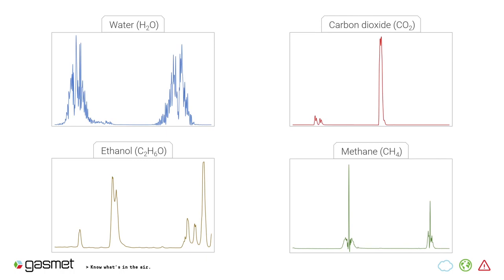So now that we have taken the measurement, what do we do with it? We talked earlier about how absorbed infrared light depends on the bonds and atoms. In different molecules, these are different, so different molecules will absorb light differently. This also means that the infrared spectra for different molecules are different, so they are like chemical fingerprints. So by comparing infrared spectra of known compounds to our sample, we can determine which compound it is. Here we have examples of 4 different compounds, and you can see that their IR spectra are quite different.